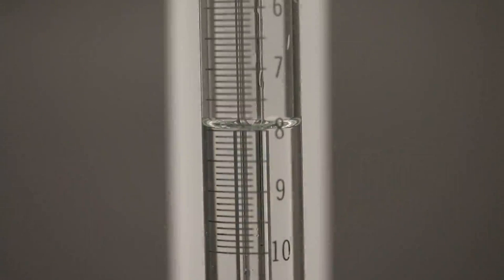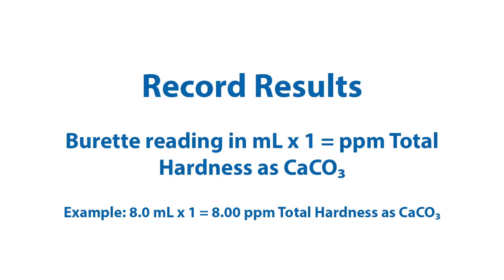Read the burette. Use the burette reading to calculate total hardness as calcium carbonate concentration.